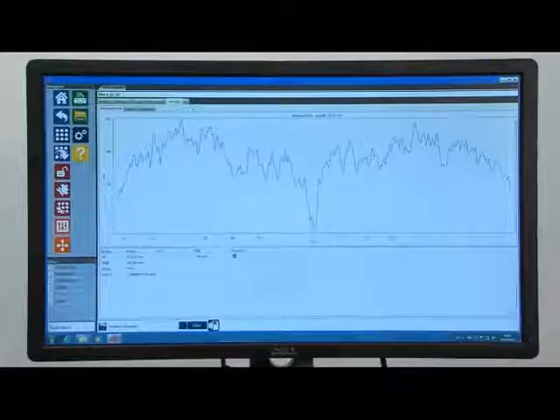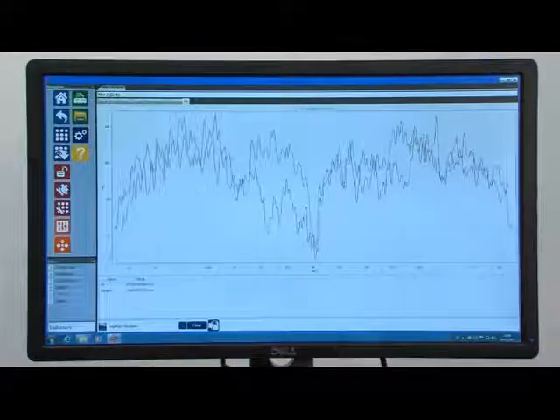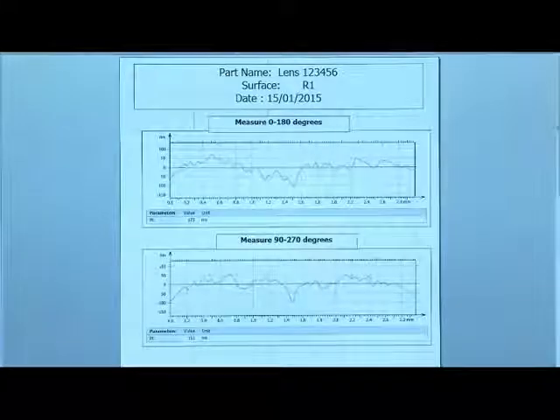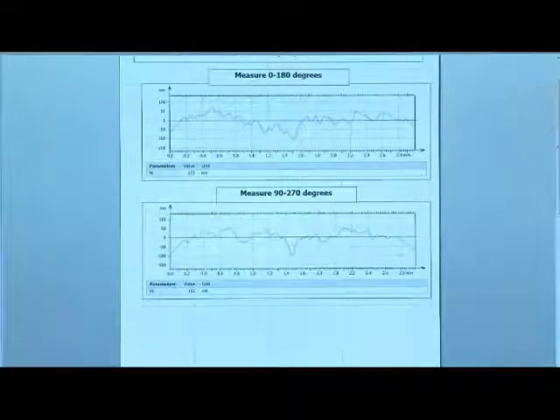Surface traces can be easily sent to TallyMap to see the results in detail and view the 3D astigmatic plot for individual parts.